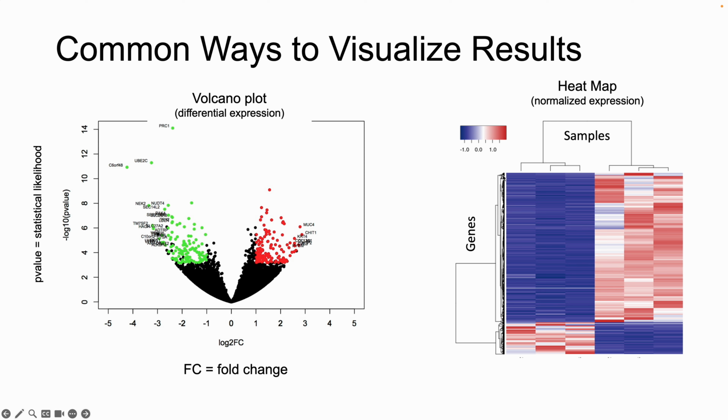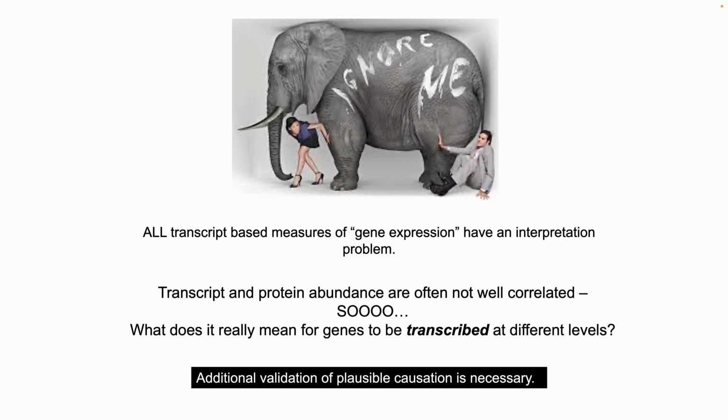And so it's showing whether, compared to all other samples within that gene, it is upregulated or downregulated compared to the average across all the samples. We'll come back to that in our Colab notebook in a second.